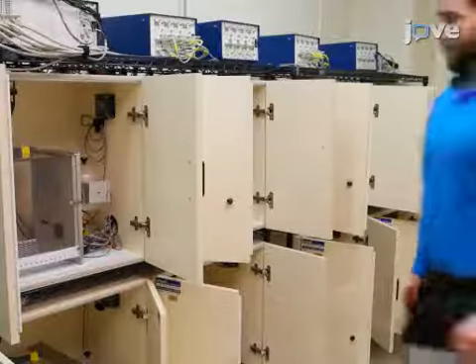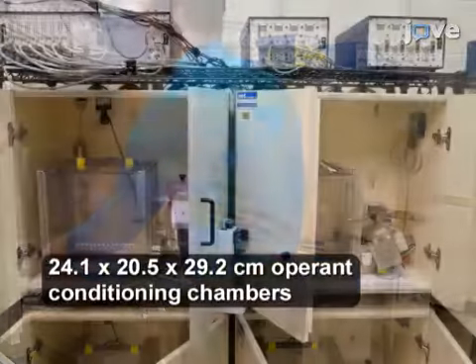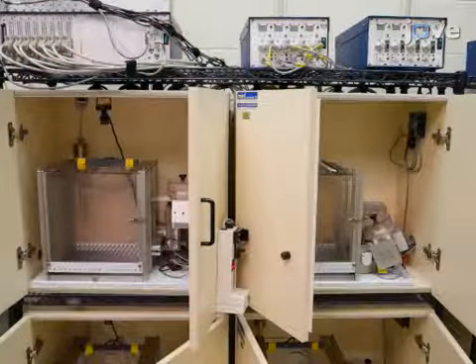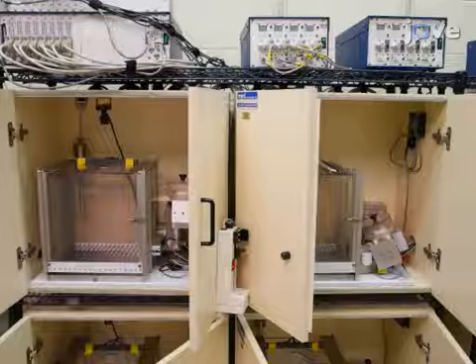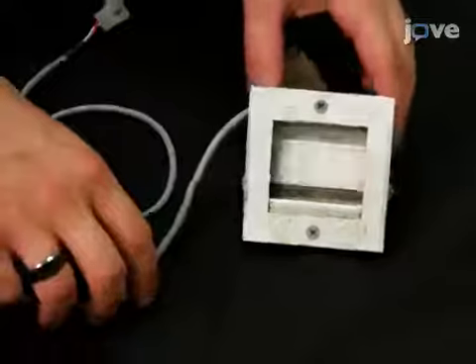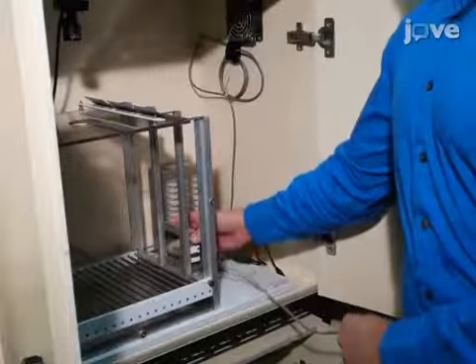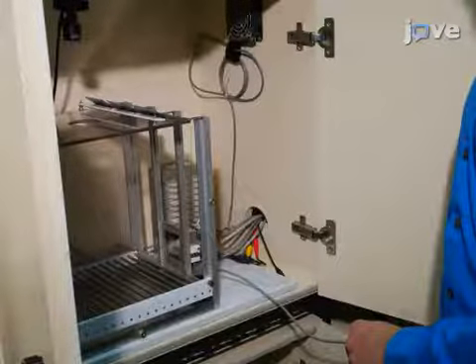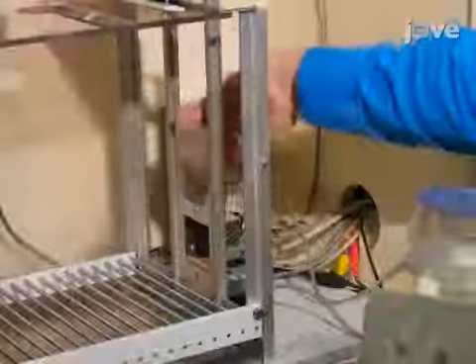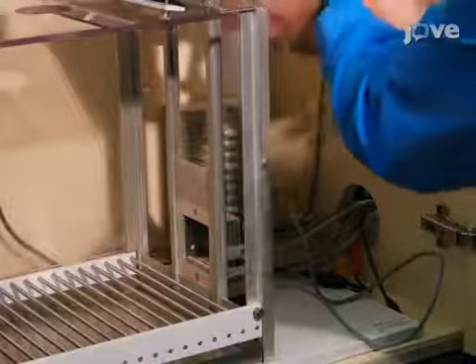This protocol utilizes commercial operant conditioning chambers in sound attenuating cabinets with ventilation fans to provide ambient noise. Within each chamber, equip a pellet magazine with an infrared sensor for head entries. Position it in the front wall of each chamber, three centimeters above the floor, and attach a dispenser to deliver 45 milligram banana flavored food pellets.